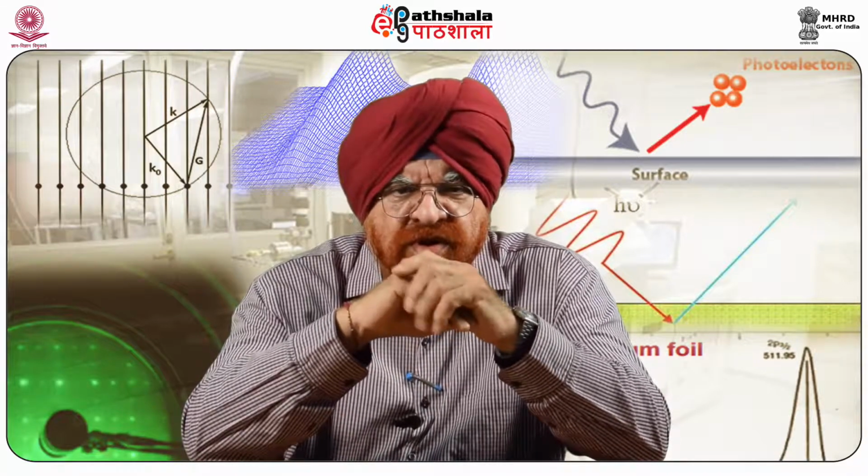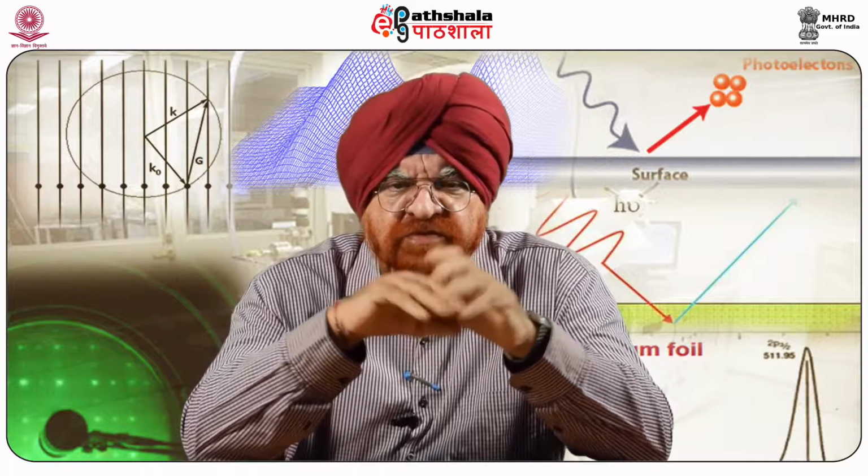In fact, and in accordance with the literature, Cho et al. in 2002 and SQUID results, no MFM signal has been observed from both the amorphous and the crystalline manganese-free germanium films.